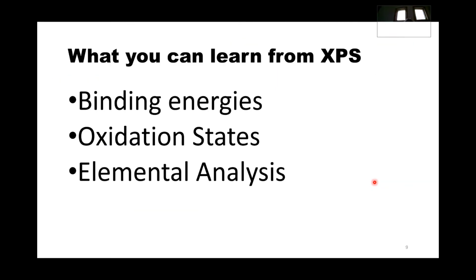What you can learn from XPS: you can learn binding energies, oxidation states, and elemental analysis. And if you look at how discrete binding energy is, hopefully you get an idea of how you figure out. So binding energies is a straight up calculation.